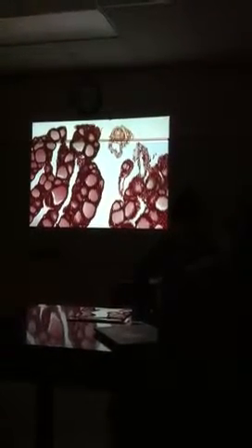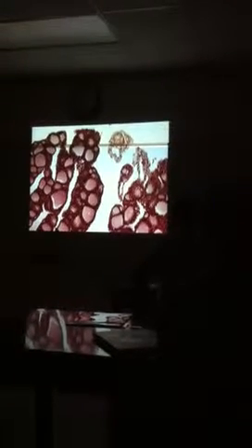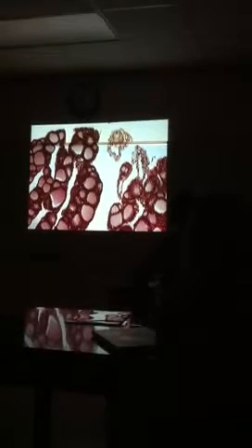Okay, what kind of tissue is this? You guys should already know. Thyroid. What's this? Colloid. These, follicular cells. These, parafollicular cells. And there is no parathyroid on this that I saw. Yeah, it's just a tiny little section of thyroid tissue.